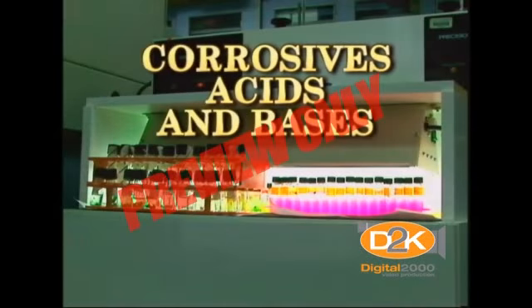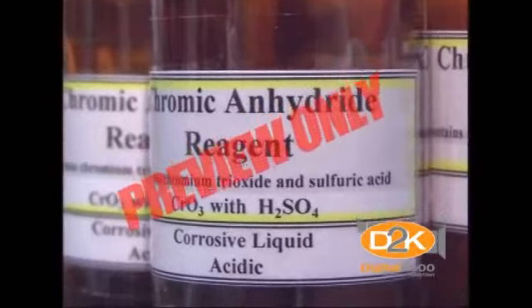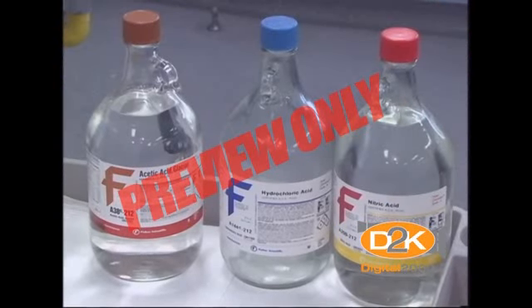Corrosives such as acids and bases. Corrosive materials are materials that can corrode the skin or metal. Examples are hydrochloric acid and sodium hydroxide.